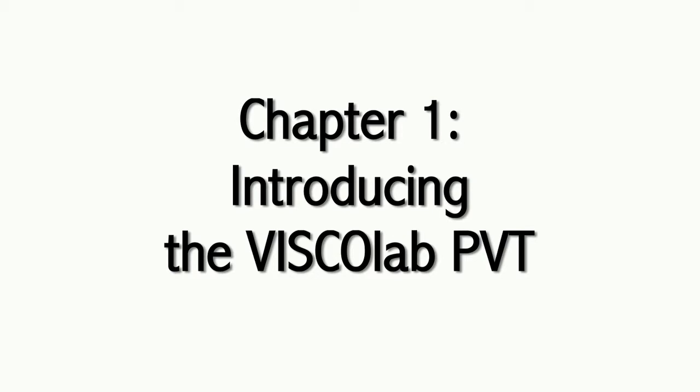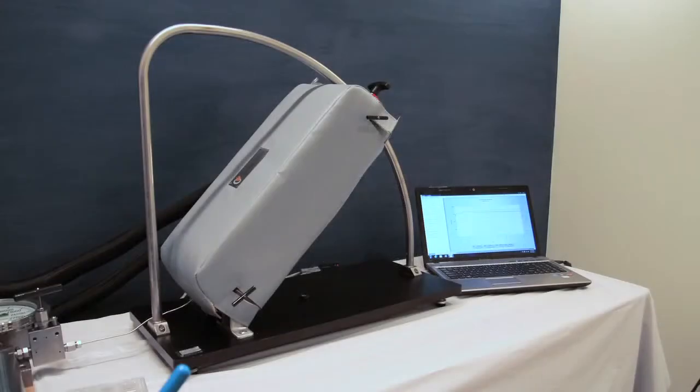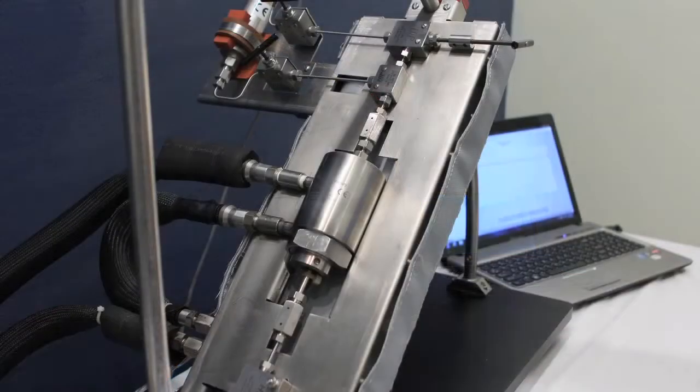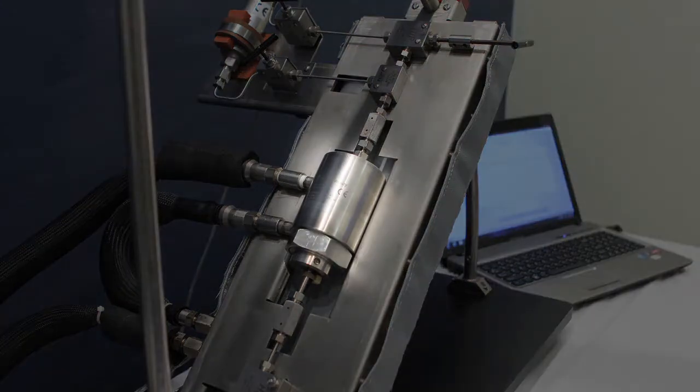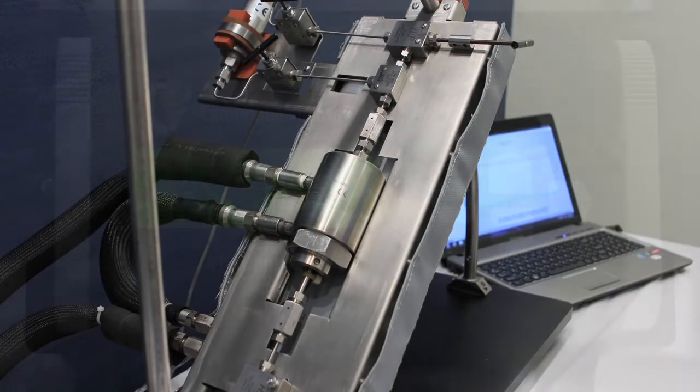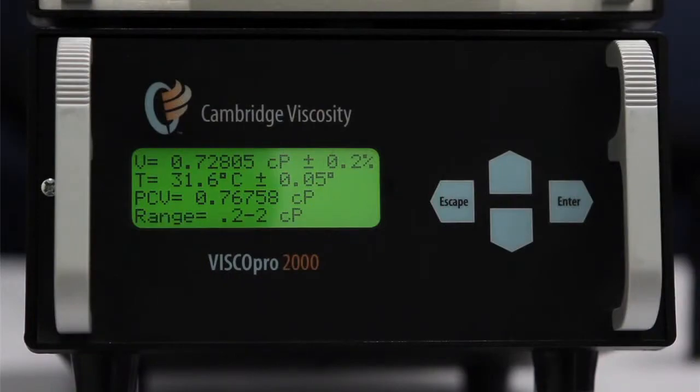We will now outline the components of our ViscoLab PVT system. Patented Cambridge SBL 440 sensor fitted with thermal jacket for heating and cooling. Visco Pro 2000 processor.